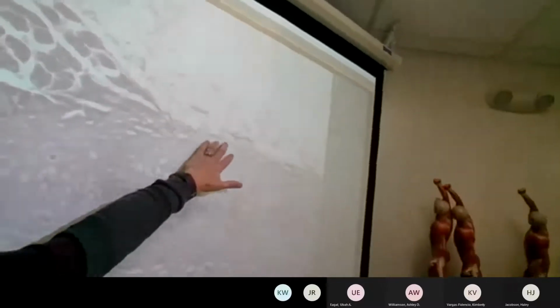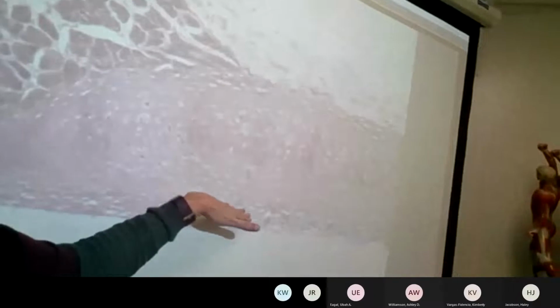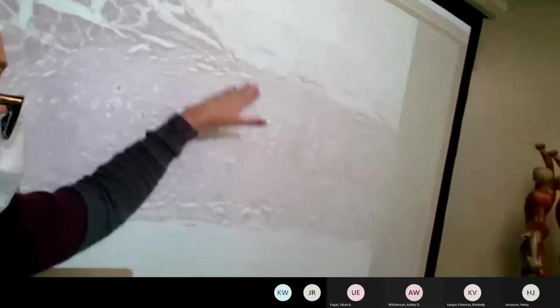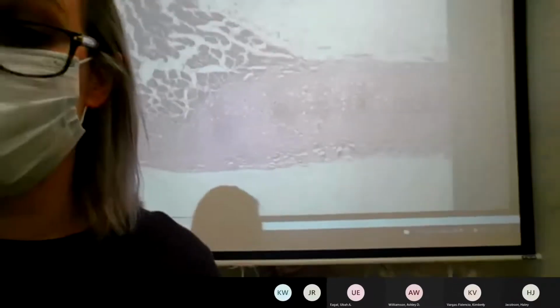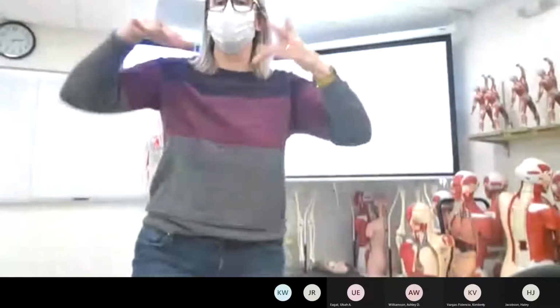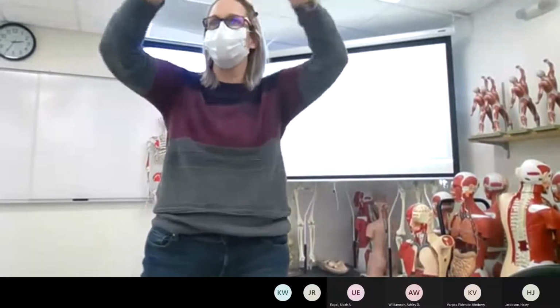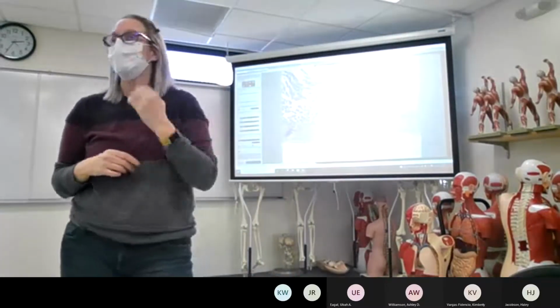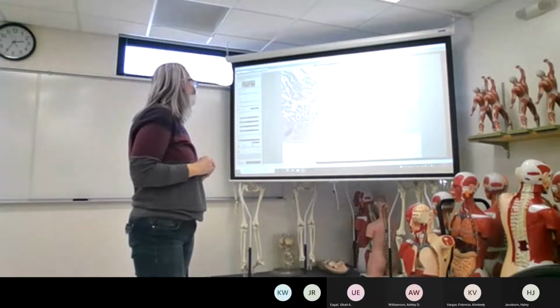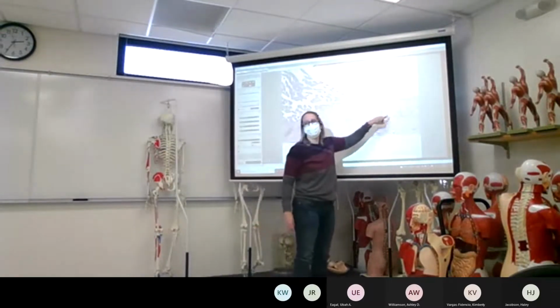Now, on the outside, remember that's your perichondrium. So there might be some dense irregular connective tissue here to provide us, again, that capsule, that material that lets the cartilage kind of, again, hold its spot and even, then slowly merge into the hypodermis or whatever other areas it needs to merge into. Okay? Typically, in the cartilage, no white blood cells, just the chondrocytes.